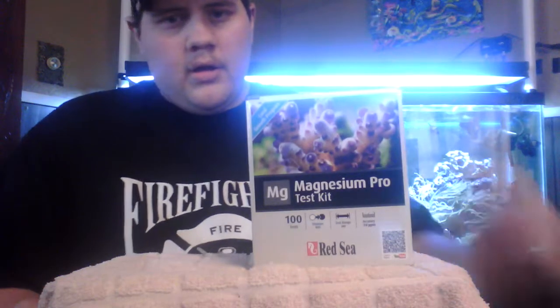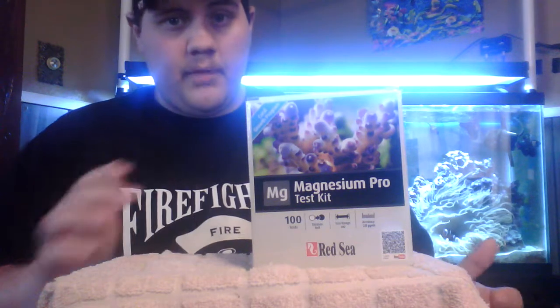Welcome back to another episode of Trevor's Reef. What we're going to do today is a product review on the Red Sea Magnesium Pro test kit. I just got this, I've used it a couple of times, I love it. I was using API's — this is so much easier. I'm going to switch all my test kits to Red Sea.